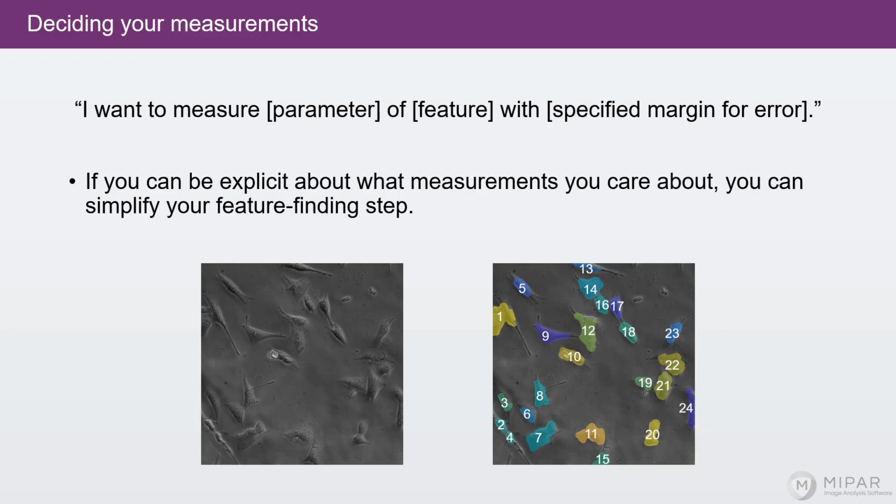This is something that becomes pretty important as you start dealing with hundreds of thousands of images, as we've seen sometimes, where the exact number isn't so important. So, of course, knowing that ahead of time gives you a lot of flexibility and a lot of freedom in developing your image analysis algorithm.